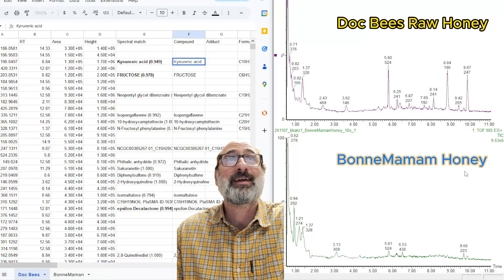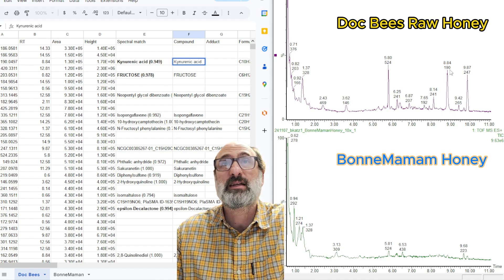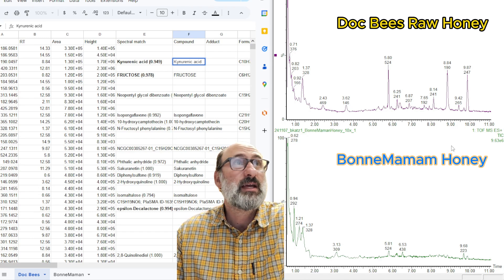We got the honey data. We got the Dockbeez on top and the Bonne Maman honey on the bottom. You can see immediately that there are way more peaks in the Dockbeez, indicating just more stuff. I'm hoping these are floral compounds from genuine honey. They're definitely reduced in the Bonne Maman — we have a few more polar peaks out front, but let's go ahead and dig into the data.